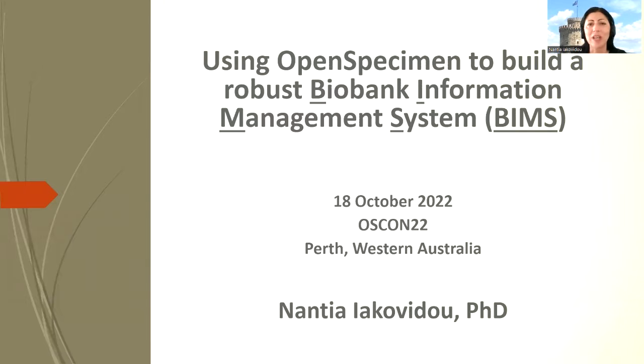I'm glad to be with you today, and I'm really excited to present to you how we use the OpenSpecimen tool, in our case, to build the Biobank Information Management System.